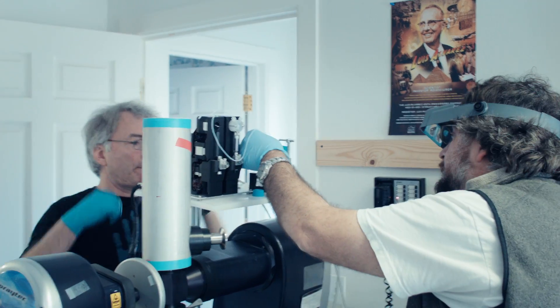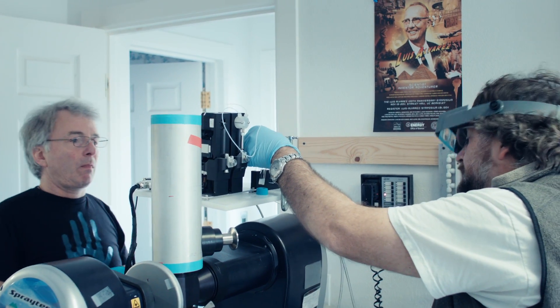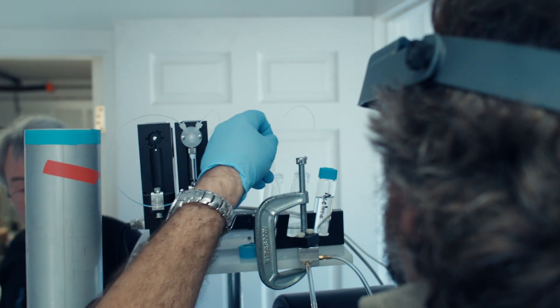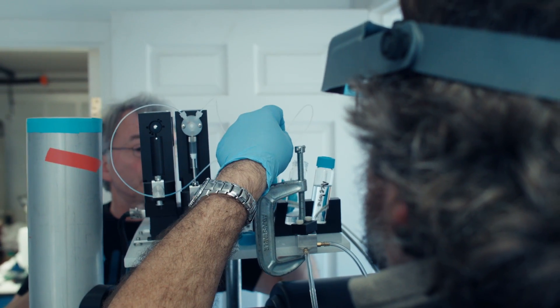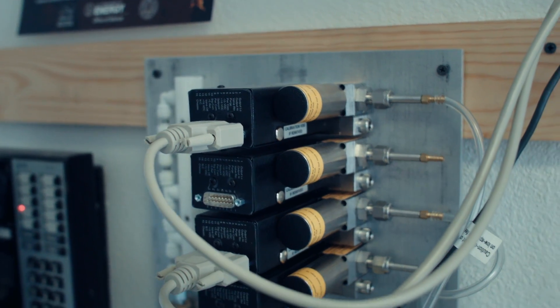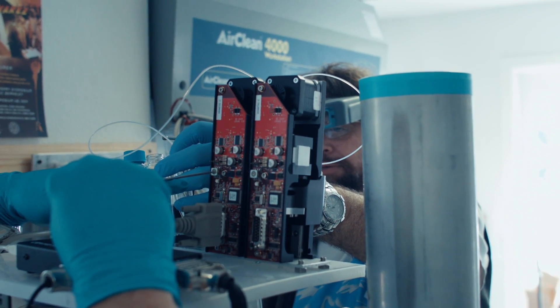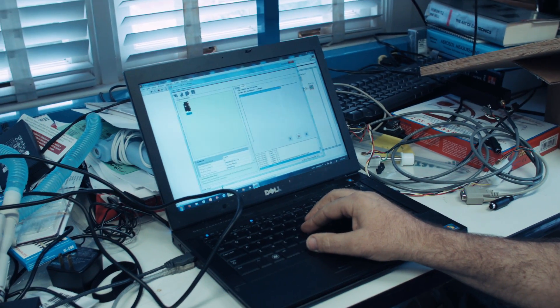We're on the prime again. This is a laser that continuously monitors the size of the particles being made, so for the manufacturing environment we actually have a closed-loop system that makes sure everything is constantly the right size. The way we vary the size is this manifold controls the reduction of liquid in the nozzle, and then we have these pressurized gas manifolds over here that go to nitrogen. All of this is controlled by sensors, feedback, and software to make sure all the pressures are correct.